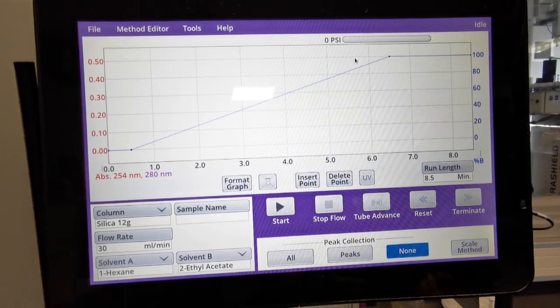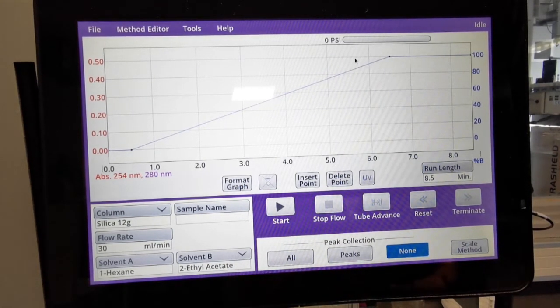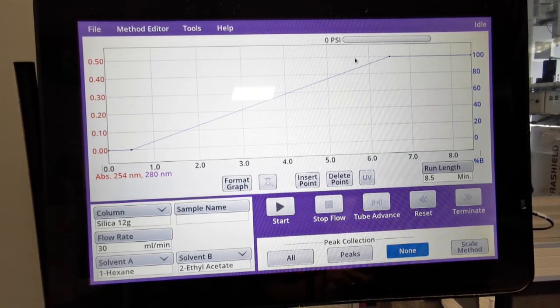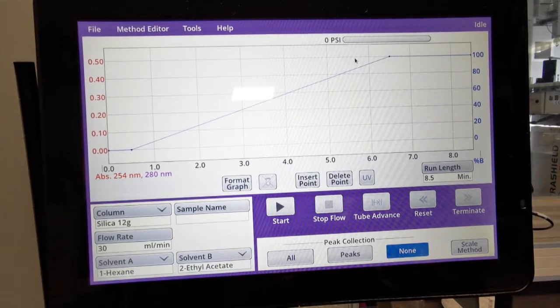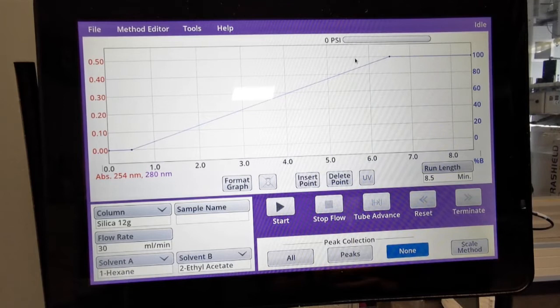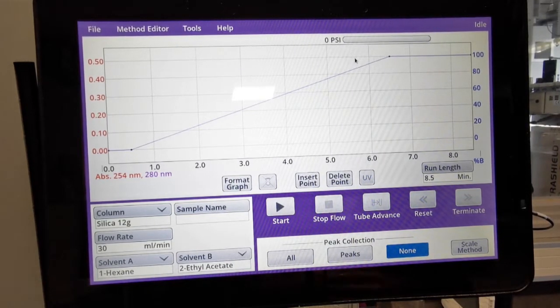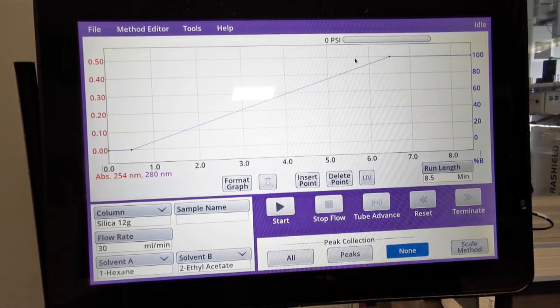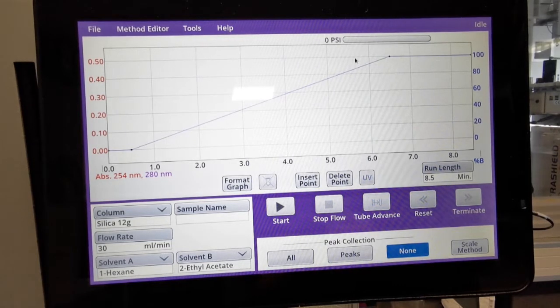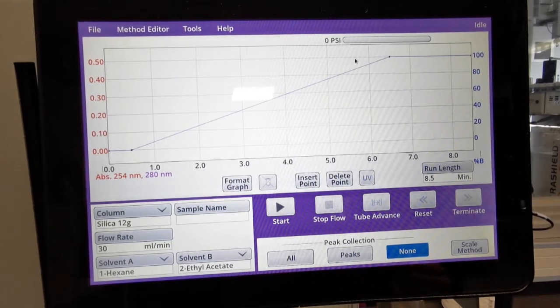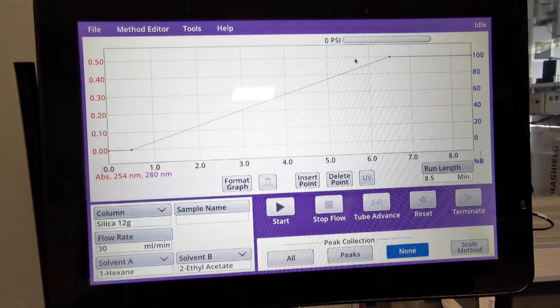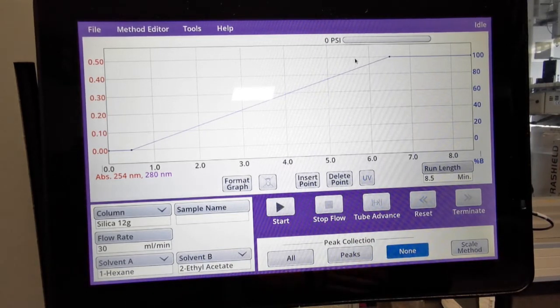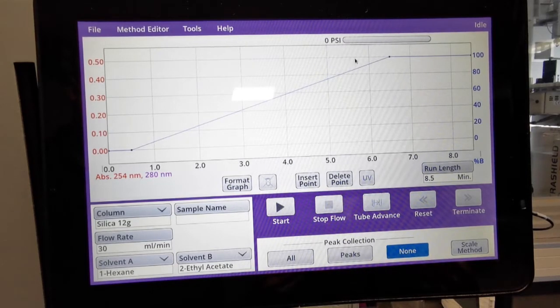You may be in a situation where from TLC you've seen that your compound will elute in DCM methanol but has some very closely running impurities. You also know from TLC that a hexane ethyl acetate gradient will remove those impurities, so you may want to run a hexane ethyl acetate gradient first and then your DCM methanol gradient to elute your compound. So how do we do that?